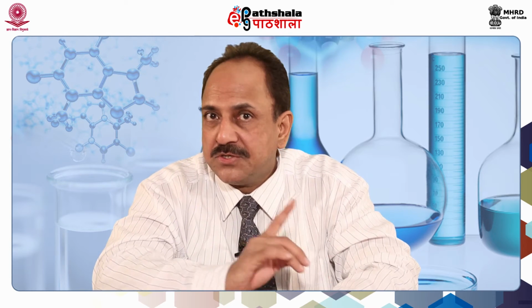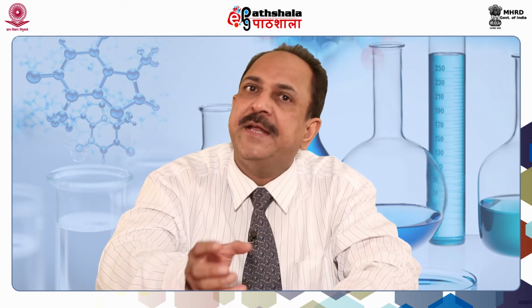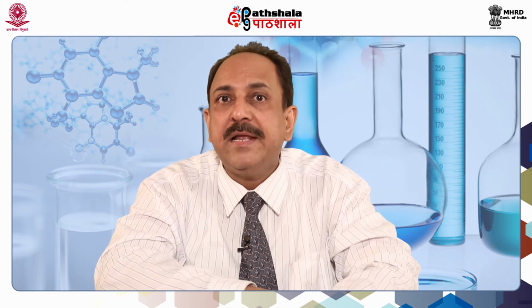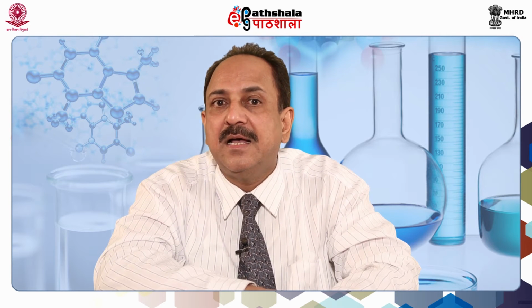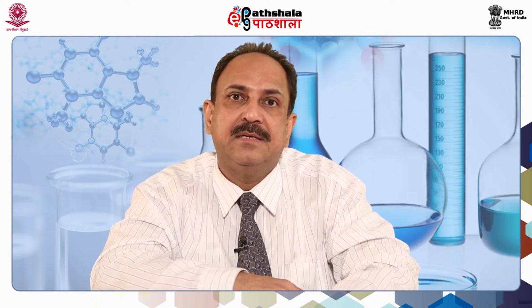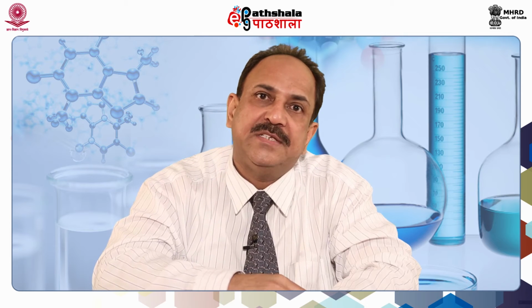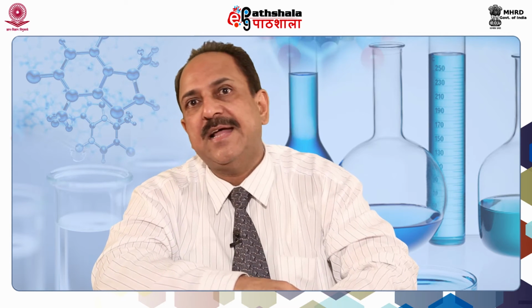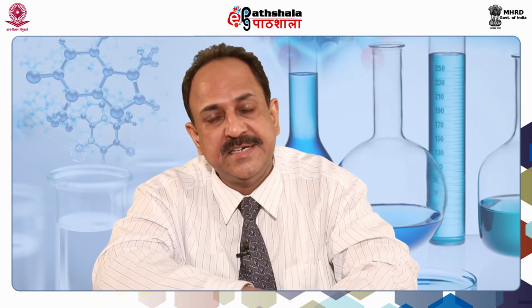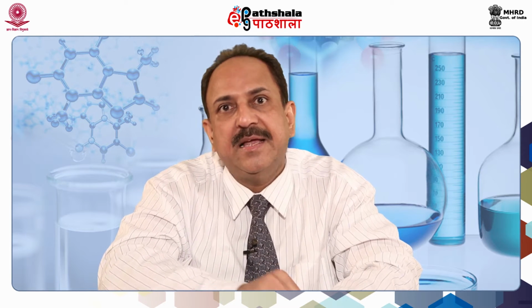Dear students, the structural analysis of an enzyme active site begins with obtaining the three-dimensional structure file, that is PDB file, from the PDB database. Molecular structures stored in PDB files are visualized using molecular graphics applications. Otherwise, a PDB file is simply a text file which has two sections. First is the header section containing the annotated information about the actual structure. Second is the coordinate section, which stores the coordinates of each of the atoms in the x, y and z directions.